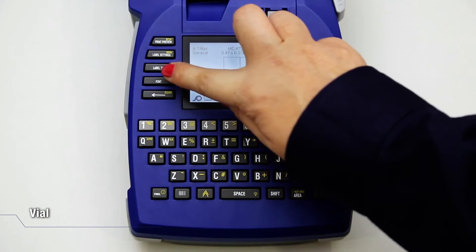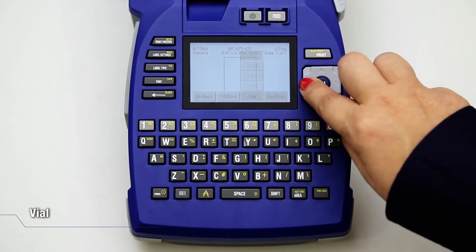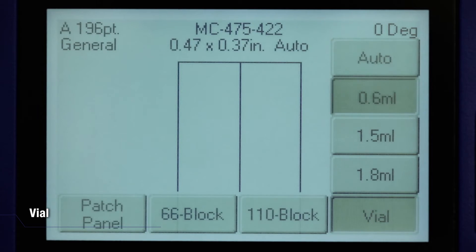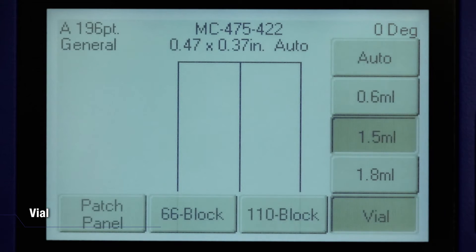Press Label Type and select Vial. Choose the vial size. The length of the print depends on the vial size — the smaller the size of the vial, the shorter the length of the print.